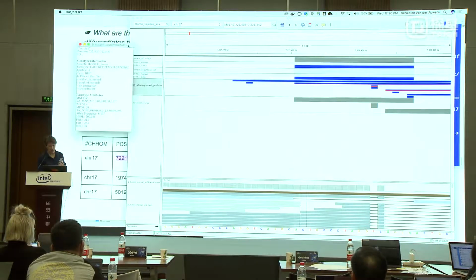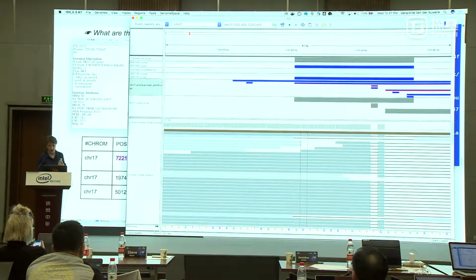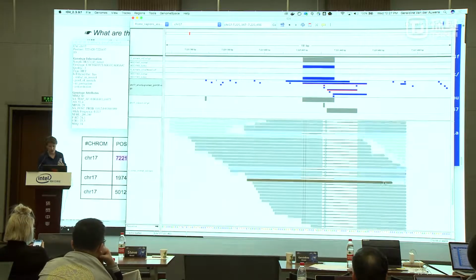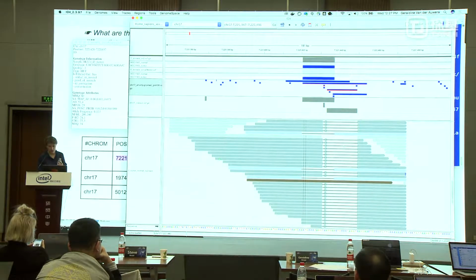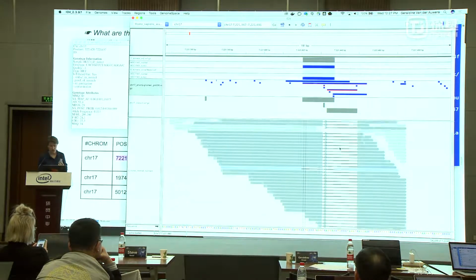So we're looking at this indel right here, but you see that there's a lot going on in both gnomAD and in the panel of normals in this region. It's a little bit complicated, but you can see that there are multiple events in proximity. There's this big deletion that seems to be present in the normal, right next to it, kind of overlapping. And then there's this other potential deletion that we're looking at.